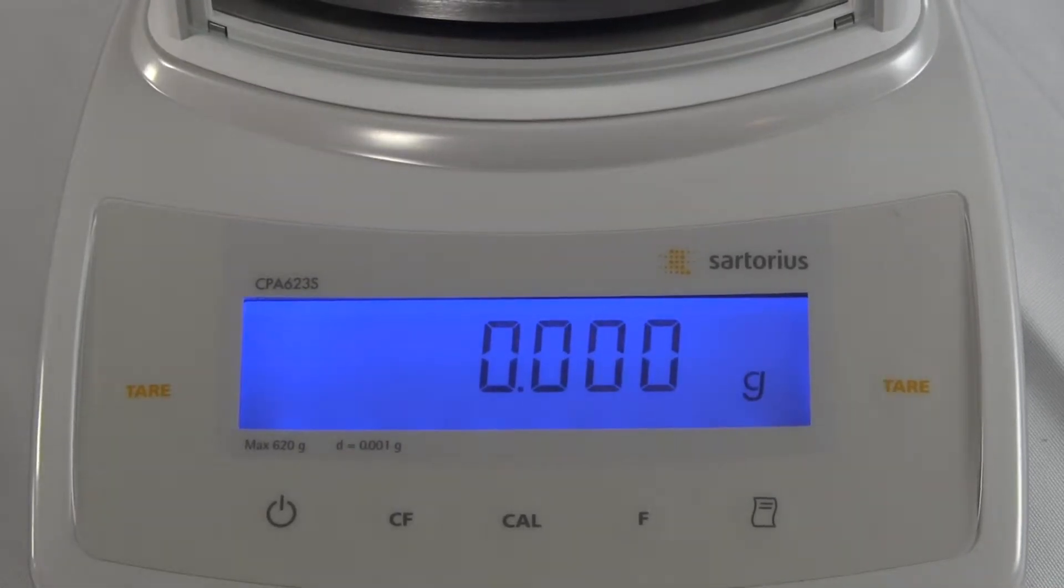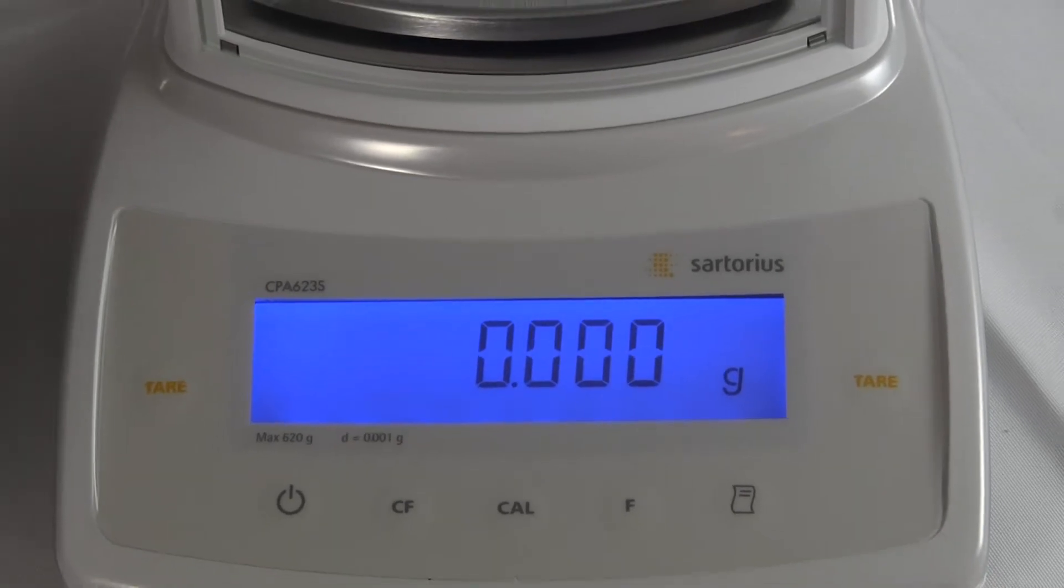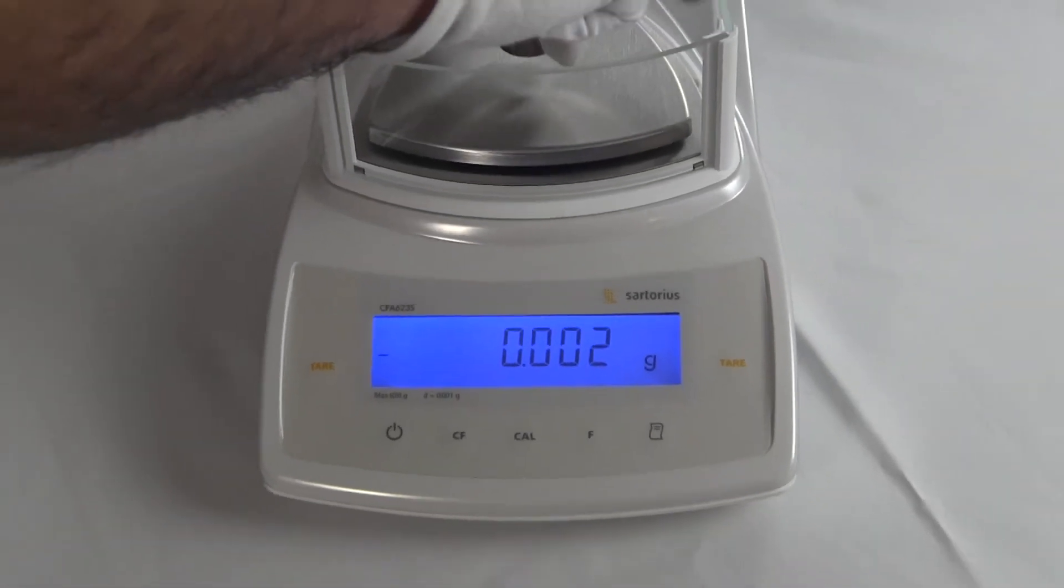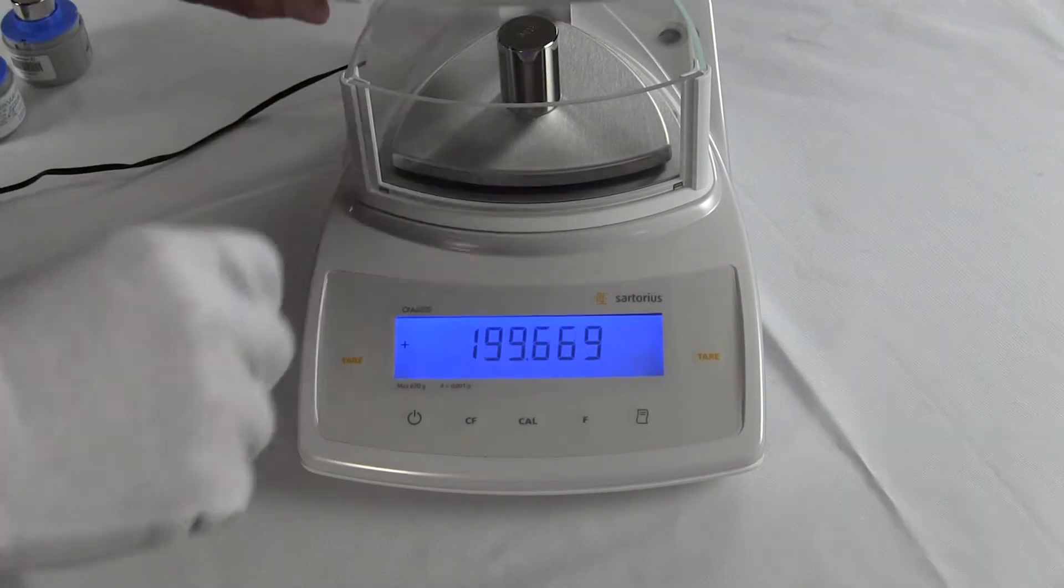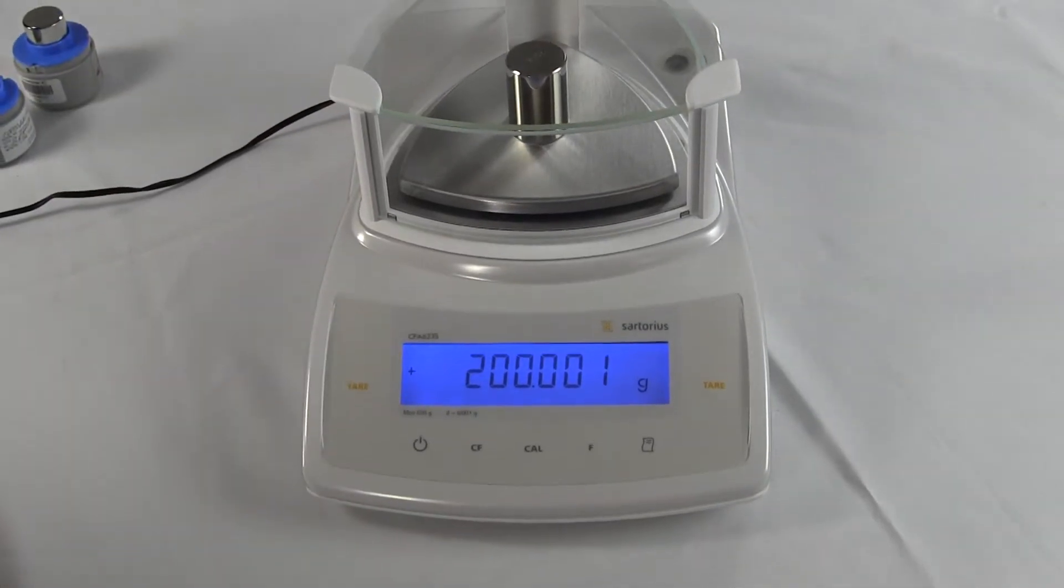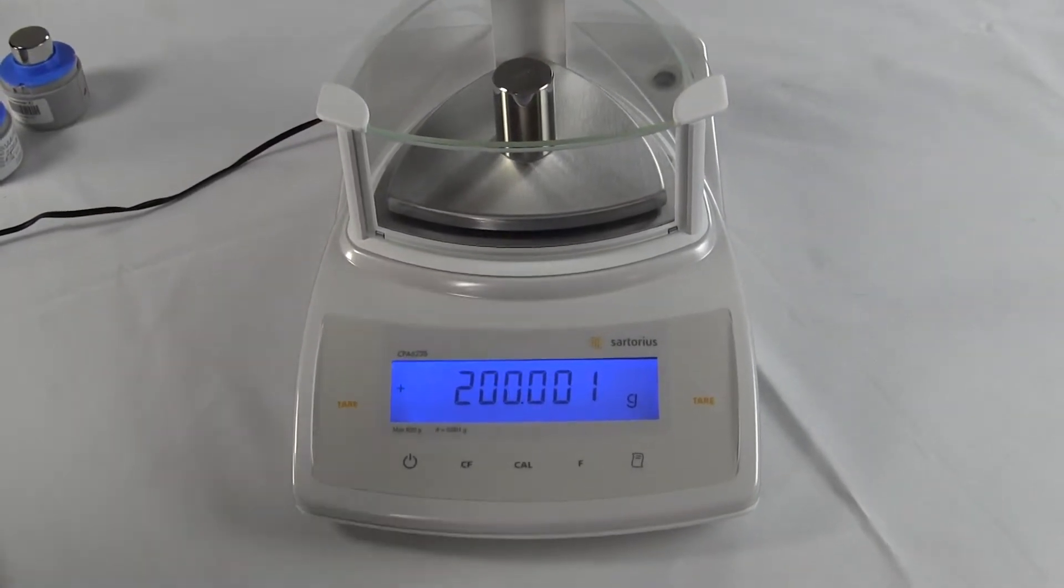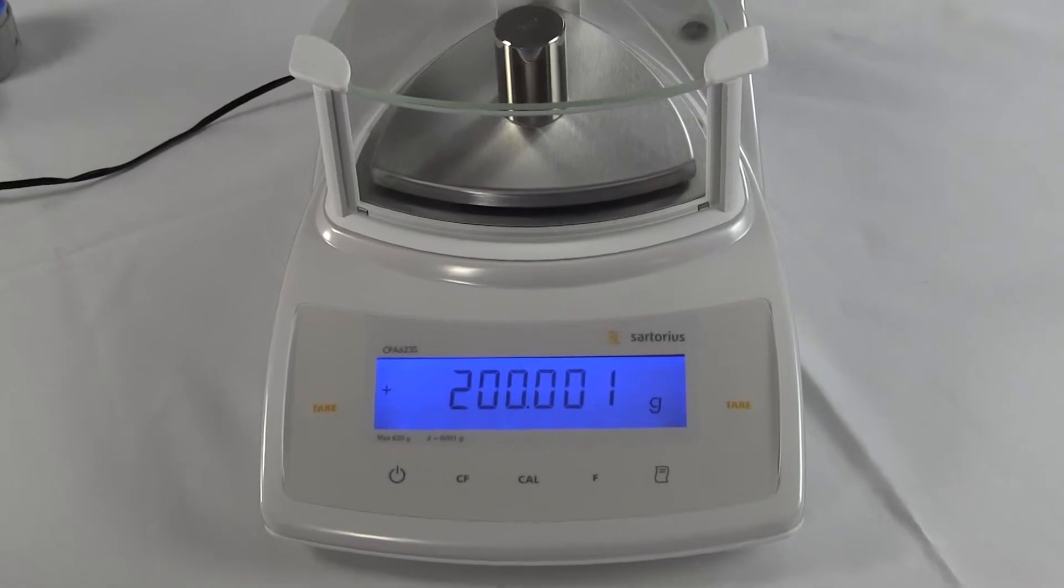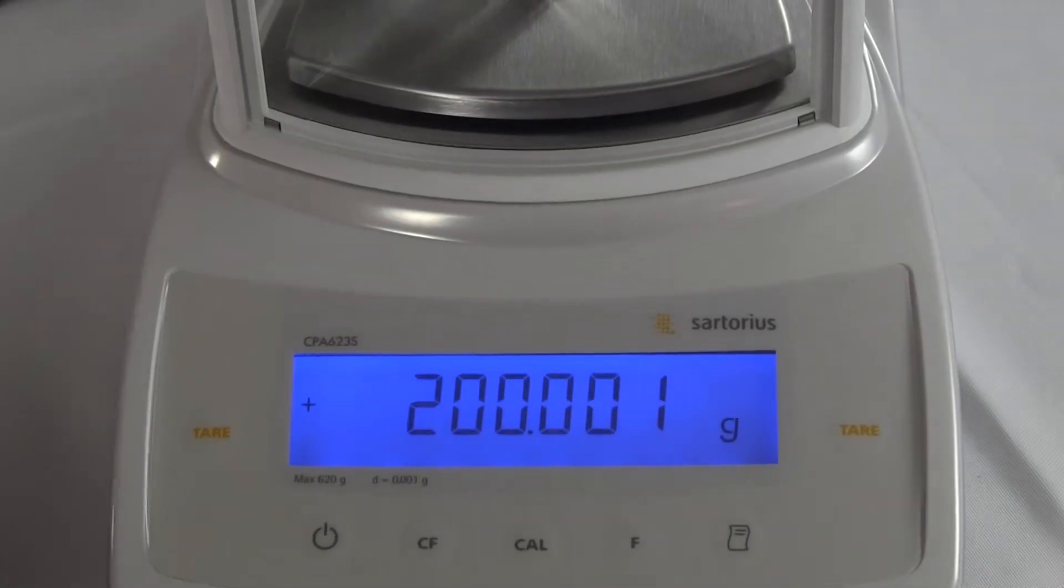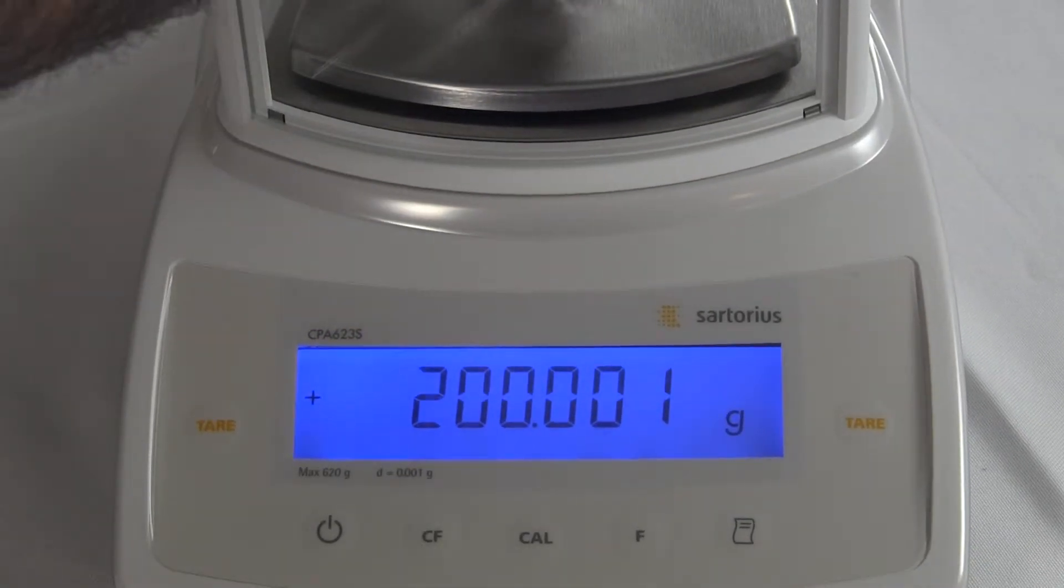So now it's CC and it goes to zero. So the balance has now been calibrated. And we'll take the 200 gram weight, put it right on the platform. And this balance is plus or minus a milligram. So we have a 200 gram weight. It's right within tolerance.